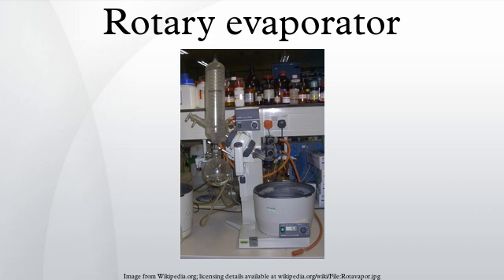In particular, bumping can often be prevented by taking homogeneous phases into the evaporation, by carefully regulating the strength of the vacuum to provide for an even rate of evaporation, or, in rare cases, through use of added agents such as boiling chips. Rotary evaporators can also be equipped with further special traps and condenser arrays that are best suited to particular difficult sample types, including those with a tendency to foam or bump.